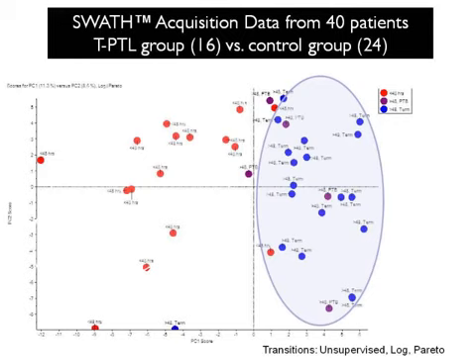We took white blood cells, we put them through mass spectrometry, through SWATH, did the data reduction. We had 1 million data points, and the idea was to try and find signals that differentiate between women who are going to give birth and women who don't. So it's a very small clinical trial, very small. And I do not mean we have found biomarkers for threatened preterm labor here.